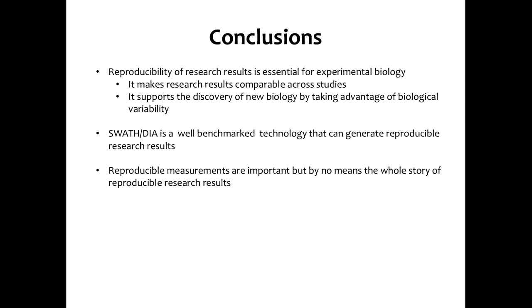And I think they're actually at least as reproducible as transcript data, except, of course, we cannot see the whole proteome, whereas transcriptomics can see the whole transcriptome. And reproducible measurements are important, but by no means the whole story of reproducible research results, which I tried to show with this HeLa example. Even if you do them with a perfectly reproducible and benchmarked technique, if the experiment is actually not the same as the other person's, then you get different results.